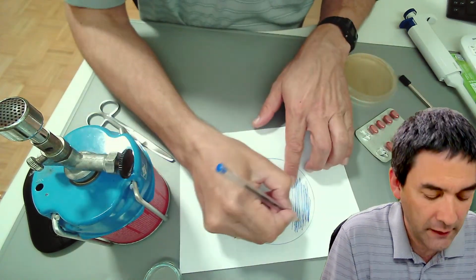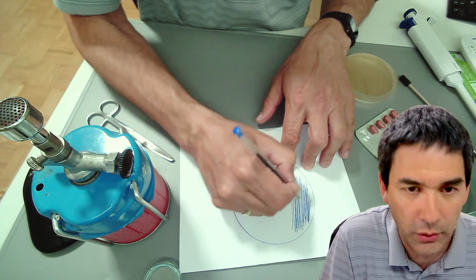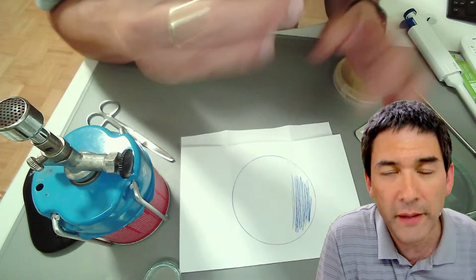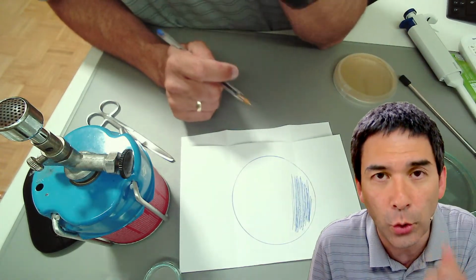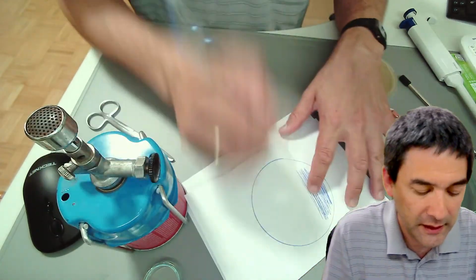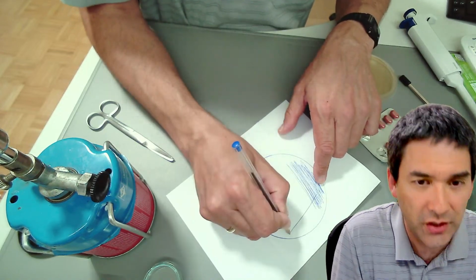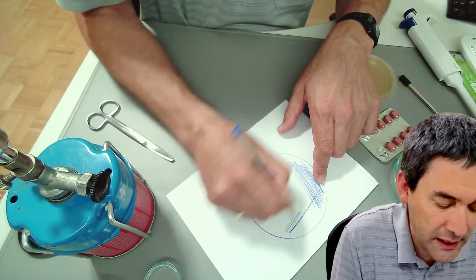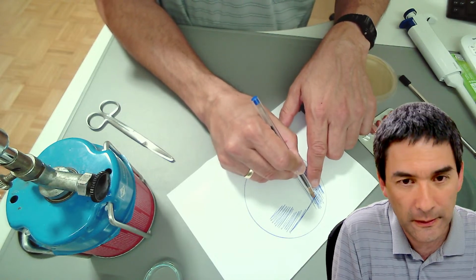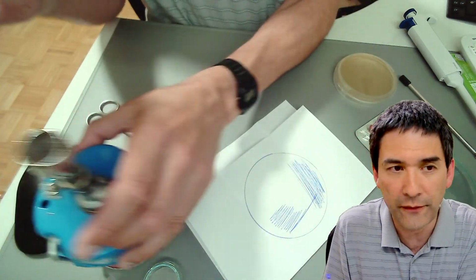So what I'm going to have here is a very, very dense spread of bacteria, we call this a bacterial lawn, with too many of them together. But what I want is to see individual colonies. So I hold the inoculation loop into the flame, and then I do the following. I go into the bacteria here and streak across, maybe twice, and then I spread again. So I'm taking a few bacteria from over here and spreading them over a larger area again. Okay, then I hold it again into the fire.